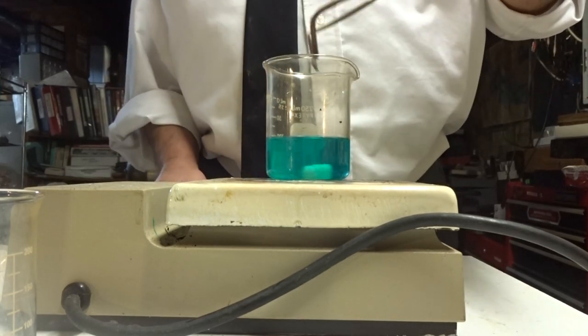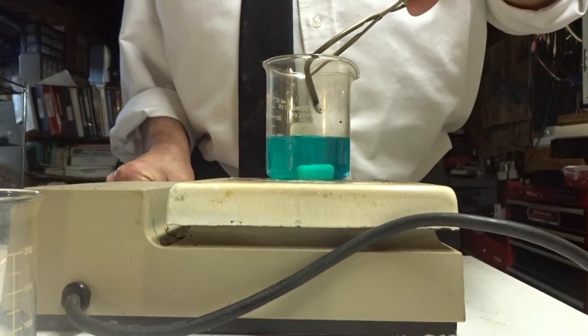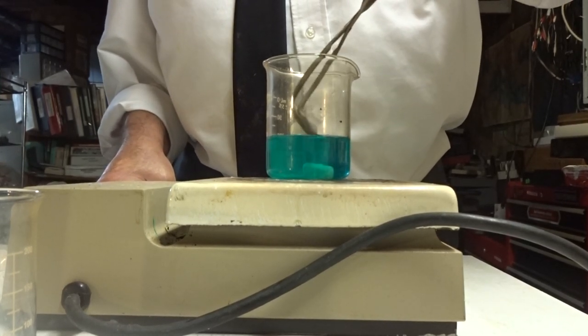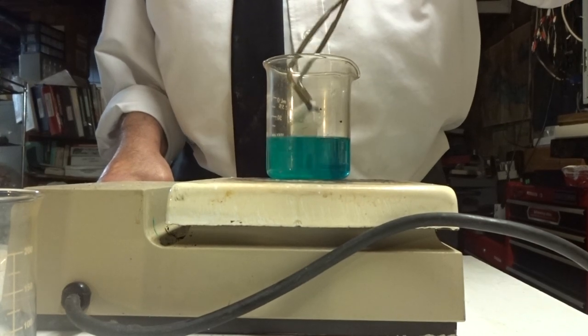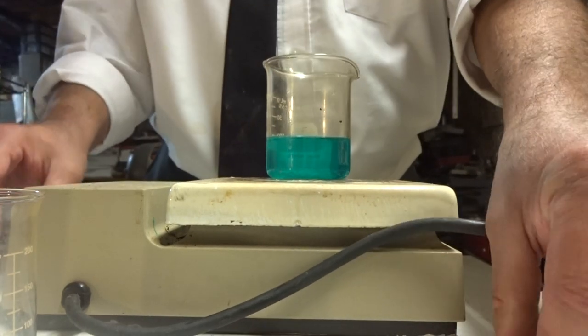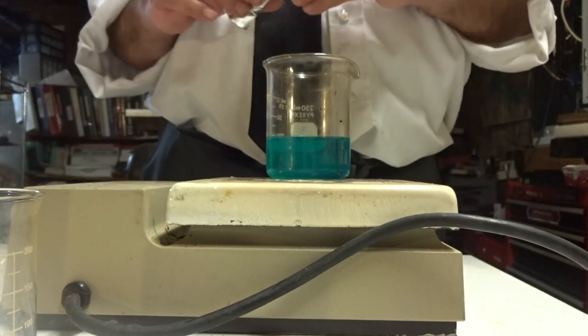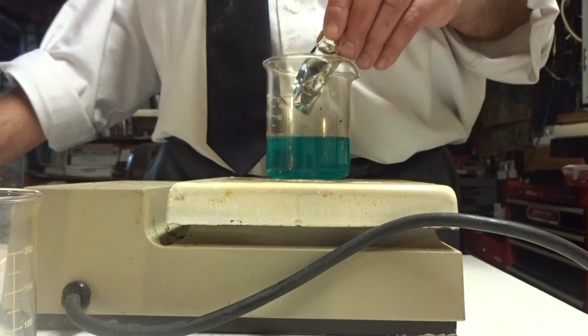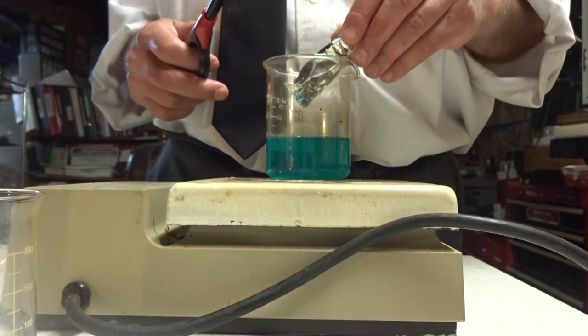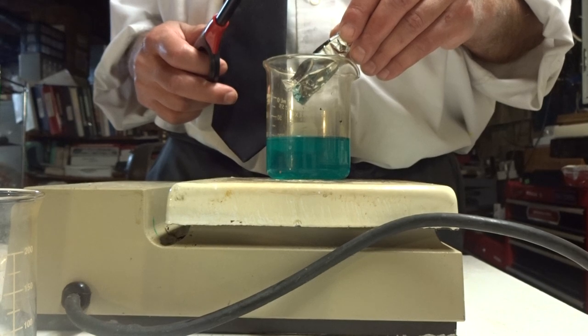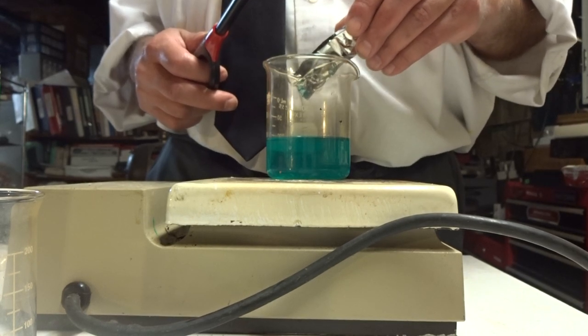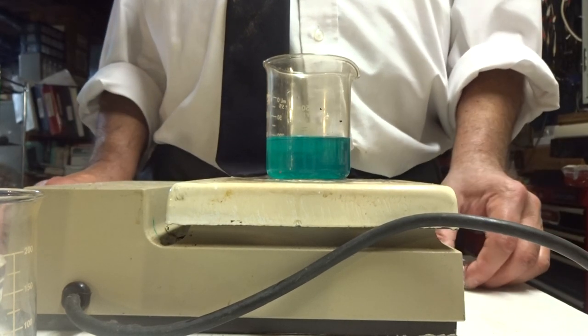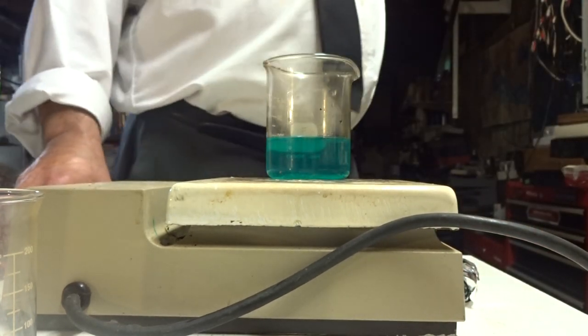That looks like it's all mixed. Now I'm going to add the aluminum foil. I'll place it in there and then light it with a lighter because the single replacement reaction is going to produce hydrogen gas which is flammable. But I need to turn the light off so you can see the flame.